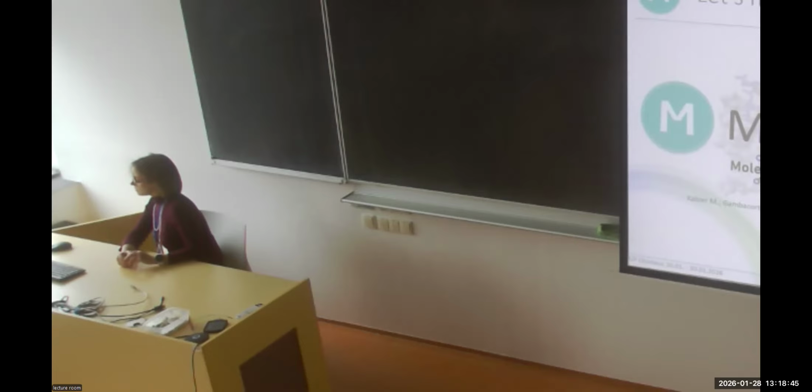PLIP instead is a graphical tool. Actually, it is a free website, so you can upload every docking result you have on this website and analyze the main interactions. And it's also implemented in MZDoc.